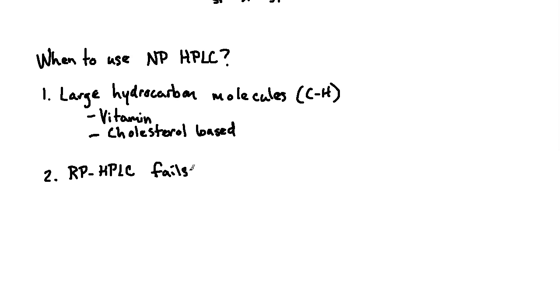But it's very different if you're, let's say, a medium-sized company and you are offering clients HPLC runs on a consistent basis to just turn around and say, oh, well, we'll just use tons and tons of hexane, right? Now, there's certain ways that you can kind of get around some of that. You can try to recover some of it, which is a pro because they have low boiling points. But generally speaking, you need to consider the amount of waste being generated, the bottom line in terms of your dollars. All of this can play into, right, something in relation to this. So what we have here, right, reverse phase HPLC fails, then normal phase may be a serious consideration after that, okay?